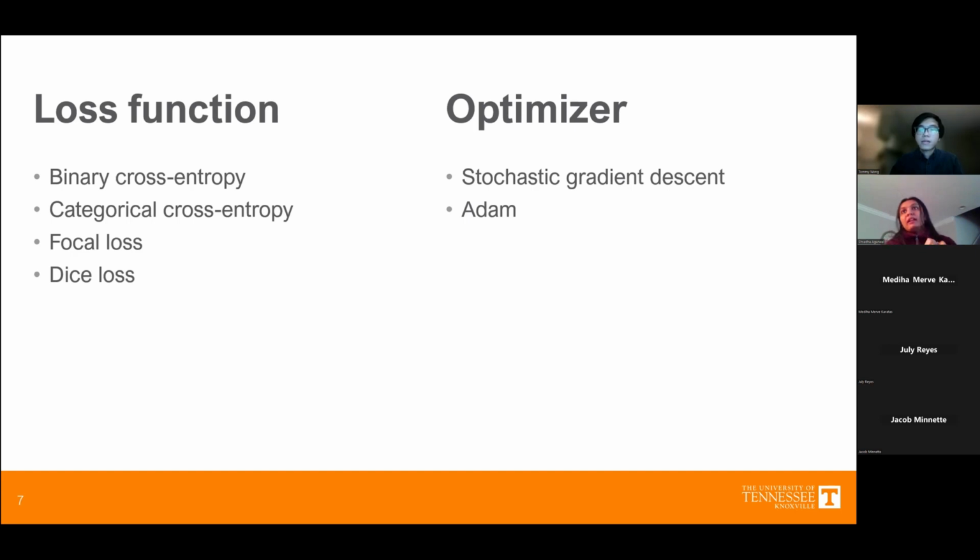And it provided a huge problem with my code when I tried to compare that. So this is just an additional point: for all imbalanced data, categorical cross entropy maybe looks very attractive from the literature, but when you really apply it, you would see that it makes more bubble predictions, and it predicts more false positives.